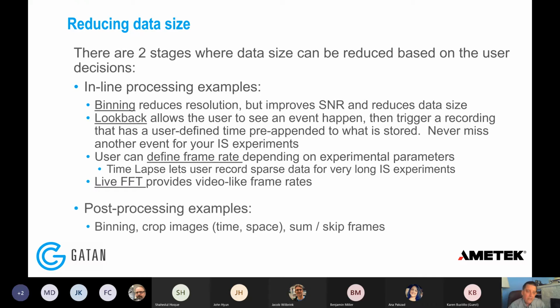So you can either do inline or you can do post-processing. And post-processing, I'll walk through a detailed example, but it could be binning, cropping the images in time or space. We can sum or skip frames.